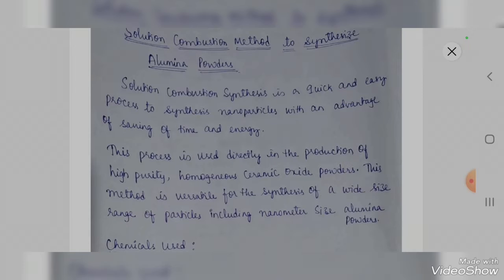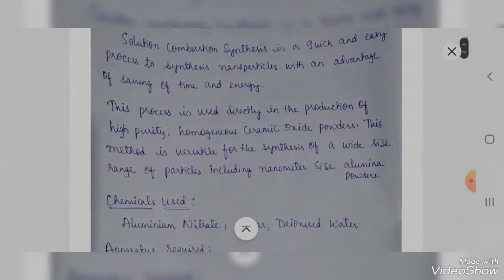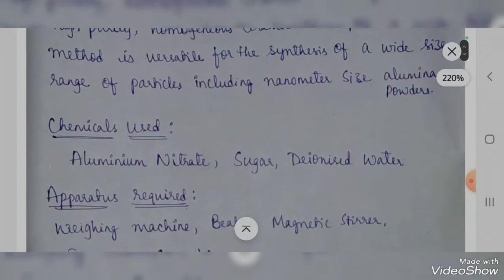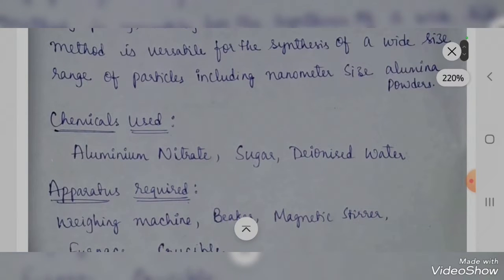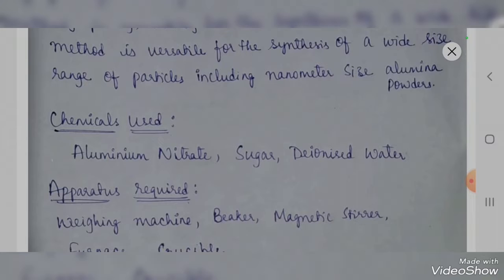This method is versatile for the synthesis of a wide size range of particles, including nanometer-size aluminum powders. In this video I am going to synthesize aluminum nanoparticles. The chemicals used here are aluminum nitrate, sugar, and deionized water.